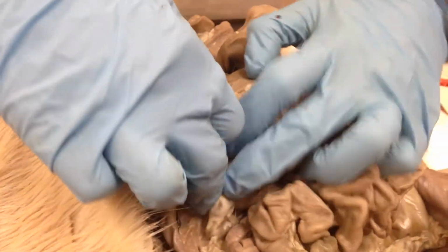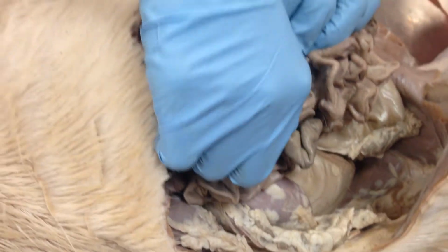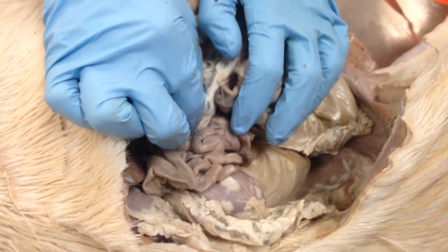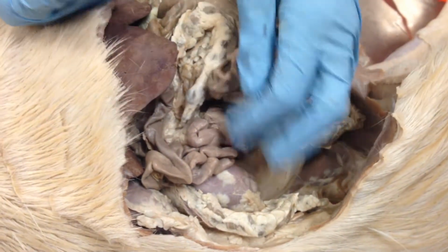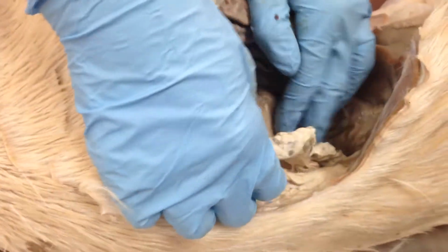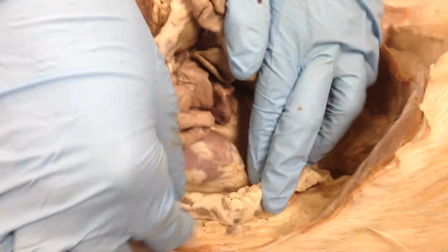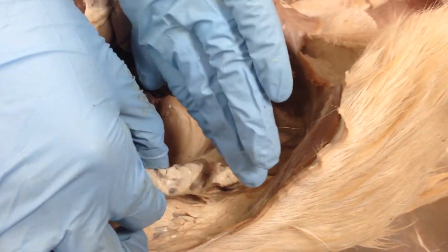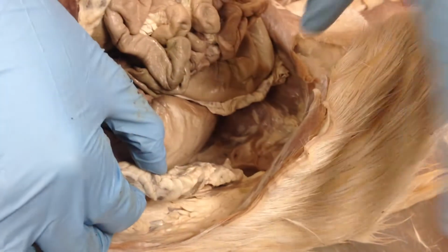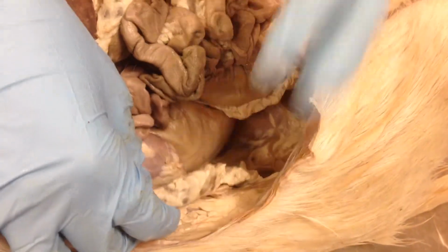It leaves the distal colon and goes across the body into the transverse colon. And we can't see the transverse colon, so we won't ask you to identify it. It's going to shoot across the body, loop back around, and go into the descending colon right here. So the descending colon is the most dorsal part, or more towards the backbone, and it transitions into the rectum and the anus. We can't identify those structures in the goat, but they do make for good definition questions.